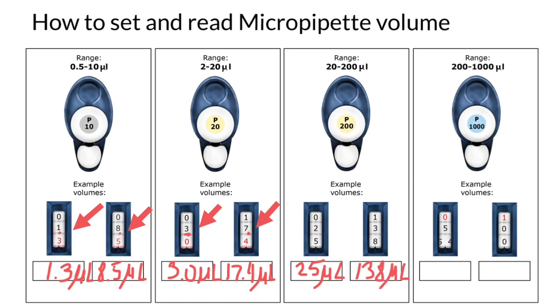But when we move to the micropipette which range is between 200 and 1000 microliters, it's going to be more challenging to understand what we have here. It is not 54 microliters, not 55 microliters, but instead this is going to be 500. But what is it going to be, 40 or 50? What is this between 40 and 50? It is 45.